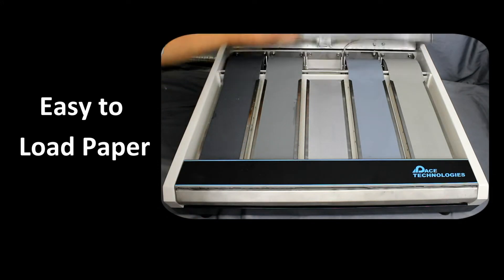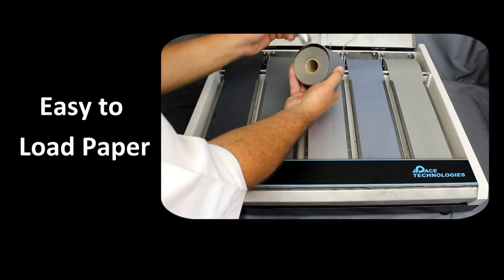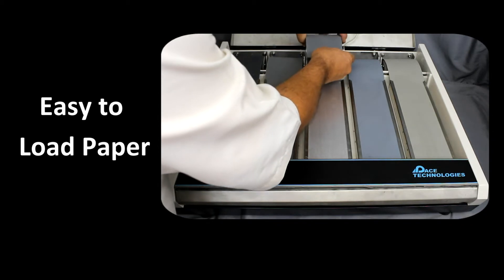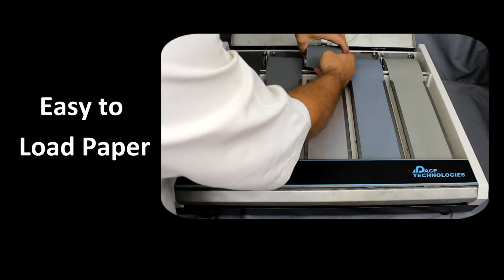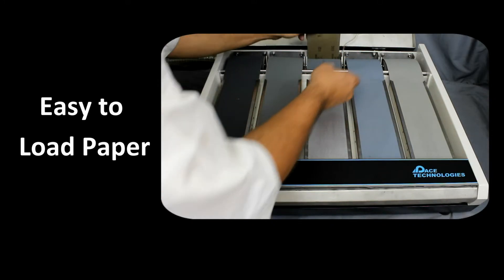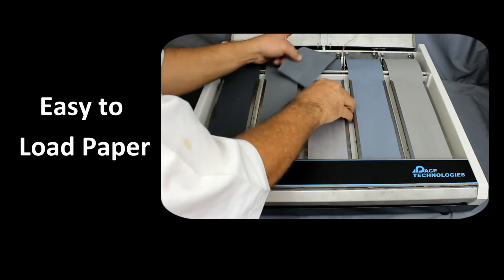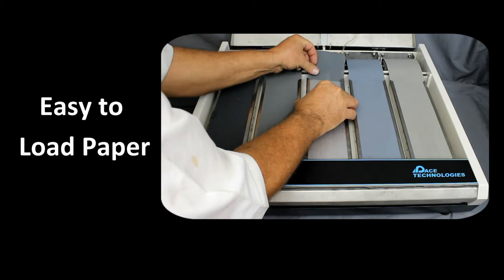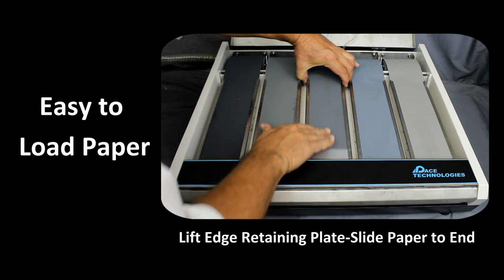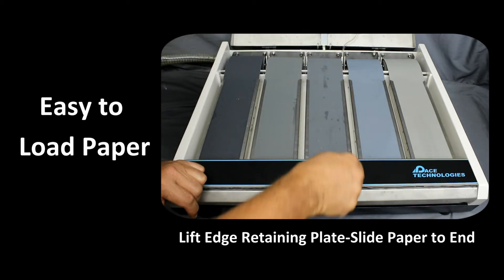Loading or changing the abrasive paper is very easy. Simply open the top cover and remove the guide roller. Insert the roller into the new abrasive grinding roll and reinsert into the Penta 5000 paper slot. Advance the paper while lifting the retaining plate, then tear or cut the excess or depleted paper at the end of the roll.